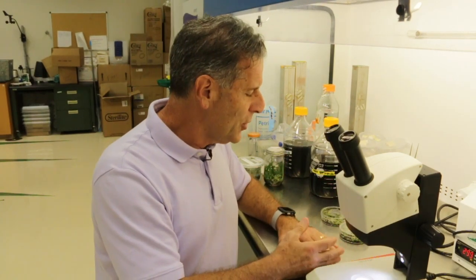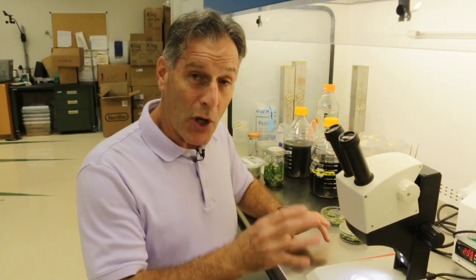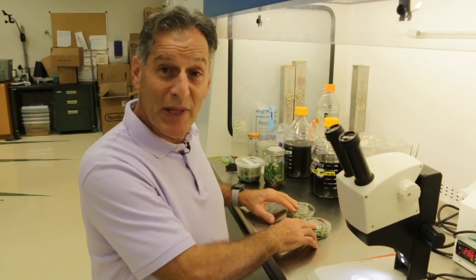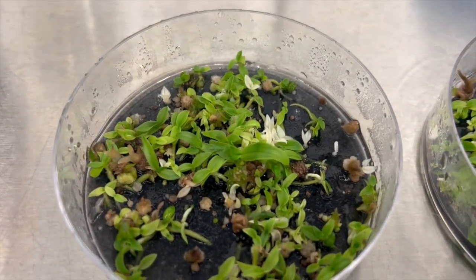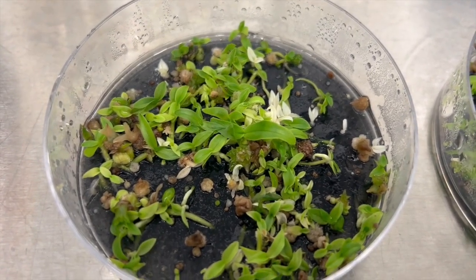As it turns out, I did 6 different seed capsules that came from that plant, and there were albinos only from one of those capsules, and these are the 2 original plates that I have from that one seed capsule. And then I looked at these seedlings in this plate, and lo and behold, guess what? A lot more albinos.